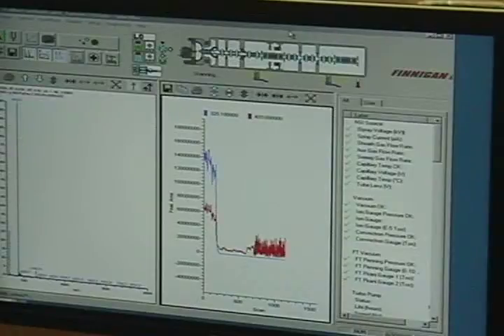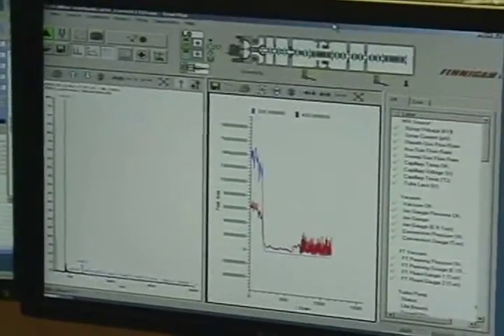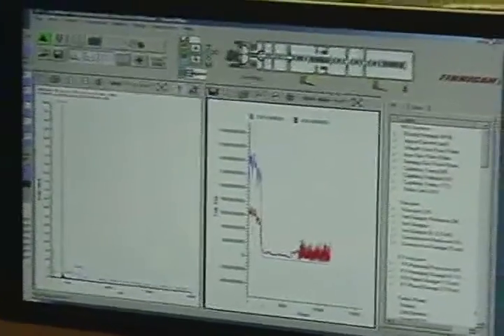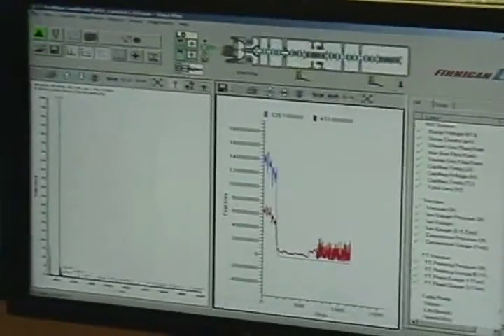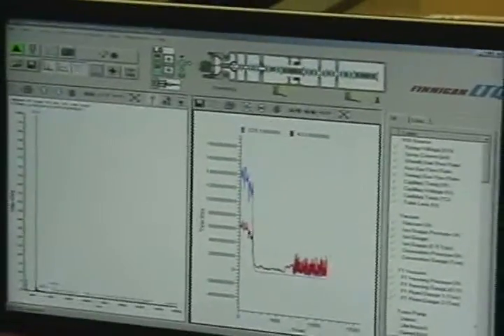So I used to do automatic. What about the tune lines? What should we do with that? Oh, auto-tune it. It'll auto-tune for you. But it doesn't go up to the range. That's what we'll check. Yep. So hit mass and put in your 433 and hit start.